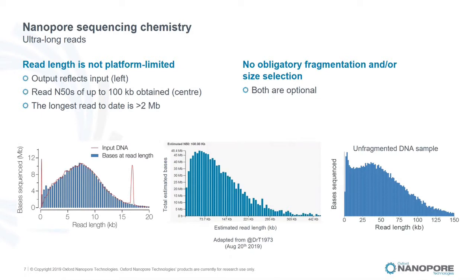But people are really adjusting those protocols, like John Tyson today, who came over from the country, and people are adjusting for longer lengths and high throughput. People are really adjusting, and we are doing a really good shape. Even with N50s in this case, like 30 or 50, you can still expect really nice throughput from this protocol.